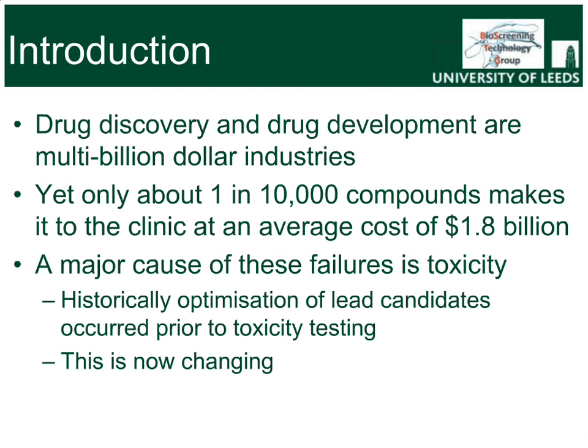In some cases, this toxicity can be anticipated based on structure-activity relationships and computer modeling, but other times it cannot be predicted, meaning that toxic compounds are not detected early and progress into ADMET and clinical trials at considerable cost. The identification of hepatotoxins is a case in point.